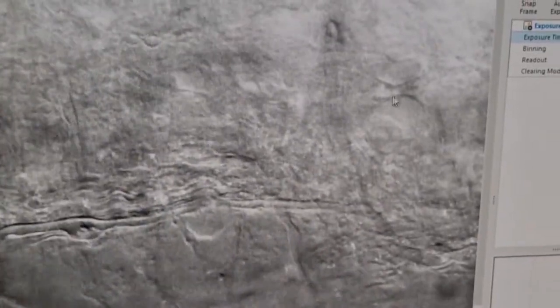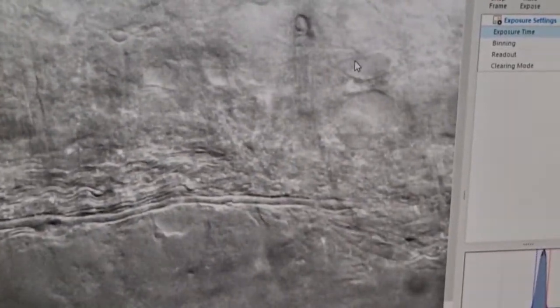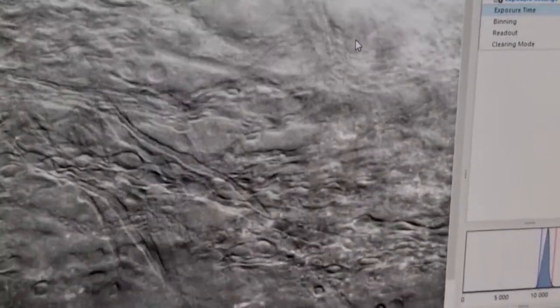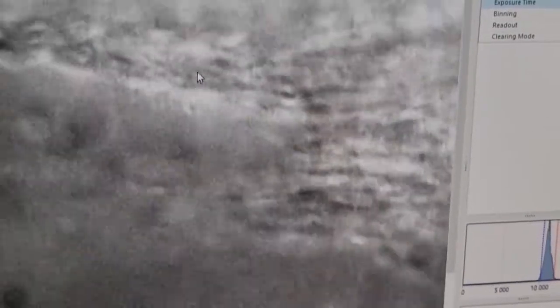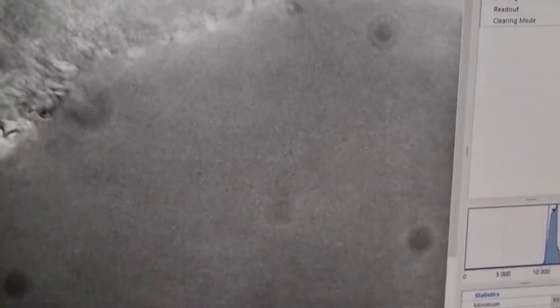After setting up optimal illumination, one can search for cells in the visual field. The structures outlined by the arrow point out superficial neurons in the spinal dorsal horn. As we go towards the midline of the preparation, climbing up on the sloping part, we reach the cut dorsal roots.